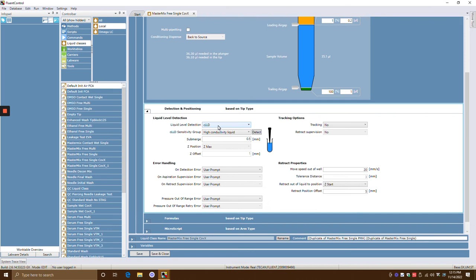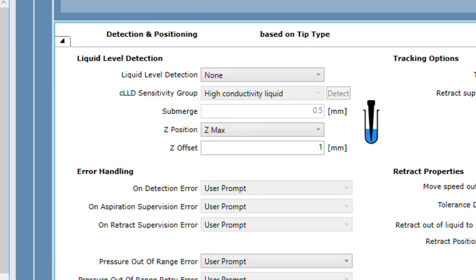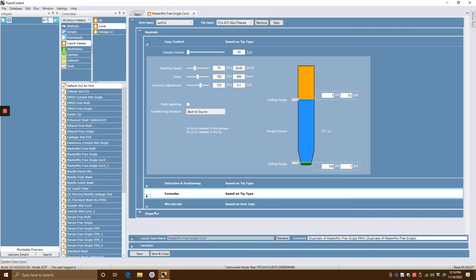Generally, for most applications I've seen, not using conductivity is much faster and better. There are some applications that might need conductivity, but more often than not I'm using non-conductive methods. The z-offset here is a positive integer — the higher the number, the greater the space above. There's a picture there that shows you. The formulas and microscripts are more intricate and most people aren't really using those, so that might be a separate video.